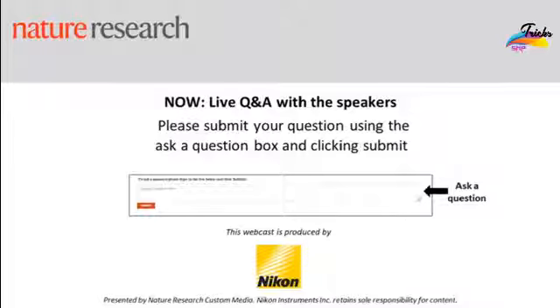Yeah, this is actually a really good question. So you actually have to break the organoid open for viruses that want to enter from the apical side, which is the case for SARS-CoV-2. If you try to infect the closed organoids, which have their basolateral side facing outside, you will have very, very limited infection.